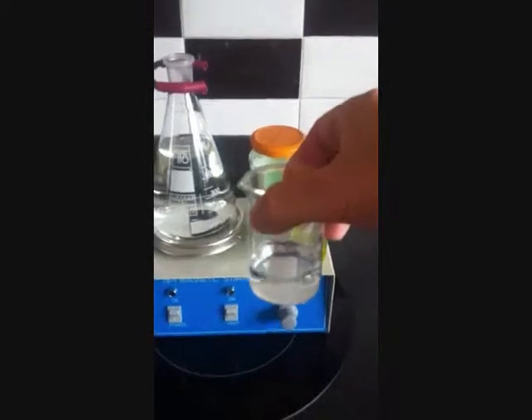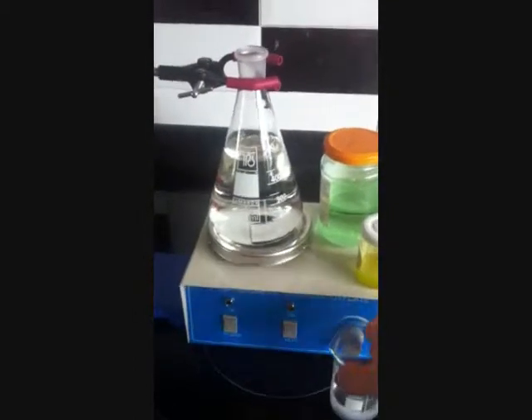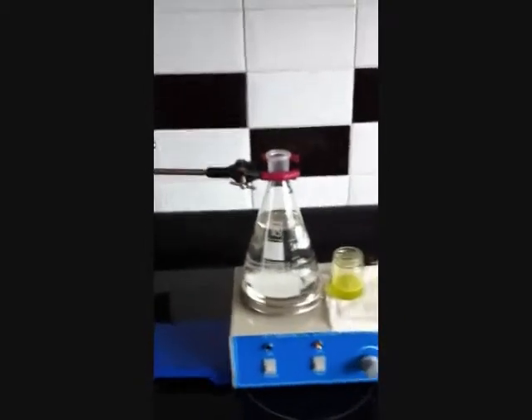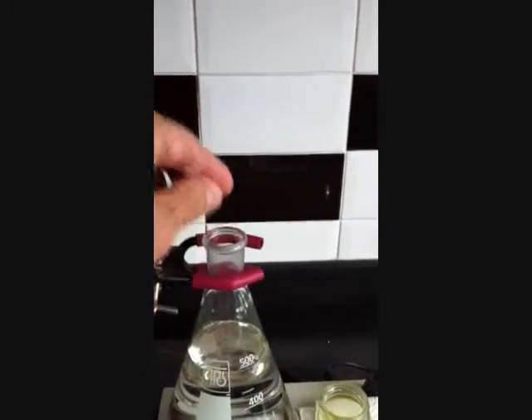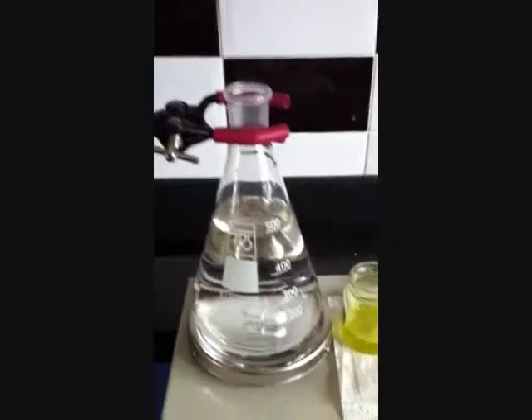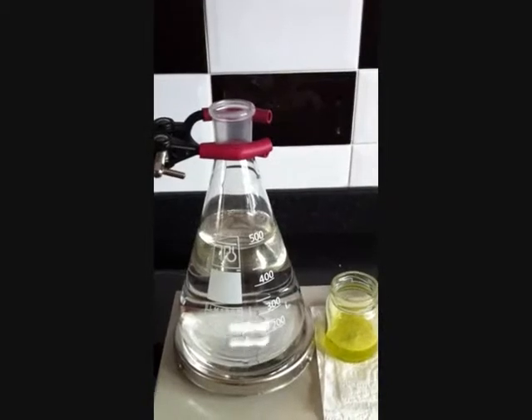This is the sodium citrate; we will add that to the thing later. We have the water sitting on top of a magnetic stirrer, so we are just going to drop in a spin bar. There is a heater on this as well, so the water is actually heating as we speak.